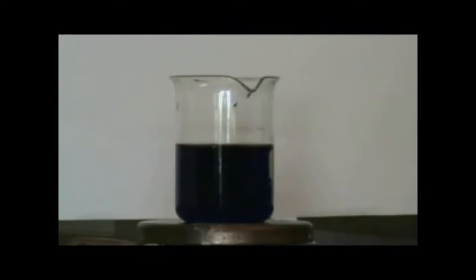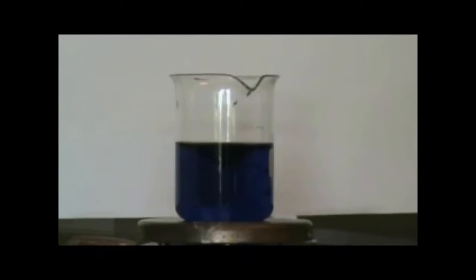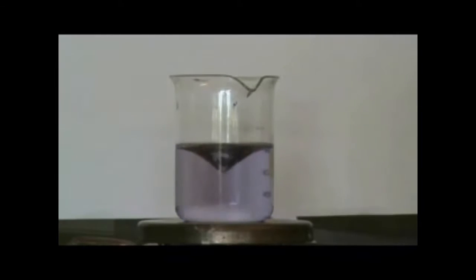Now let's see what will happen if we double the temperature. It immediately turned a deep blue color once hydrogen peroxide was added, indicating that an increase in temperature will increase the rate of reaction.